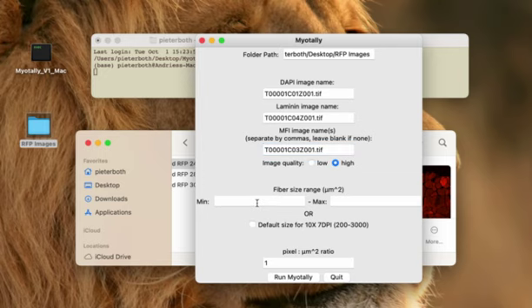Next, you can put in the range of muscle fiber sizes from minimum to maximum. For this example, I'm going to use 200 to 6,000, but we determined this range empirically for cross sections of mouse TA muscles, and whatever muscle you might be using could have a different range, and I recommend determining this range empirically. But this would be a good starting range for trial and error if you want to start out with this, and look and see if you're missing some smaller fibers or some larger fibers, you can adjust this size range accordingly.